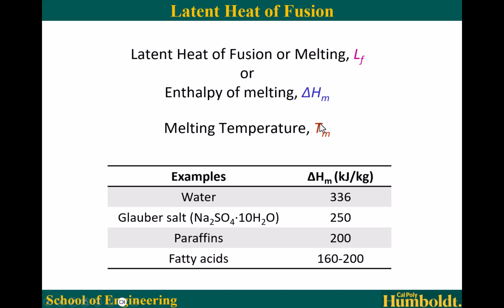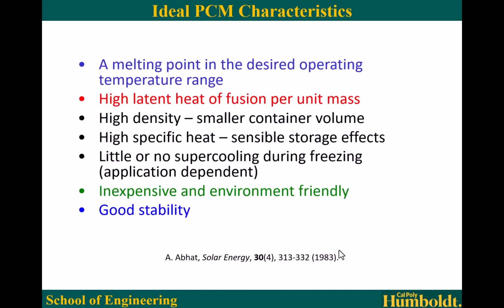So that's kind of the key metric. You can measure the enthalpy of fusion with basically a differential scanning calorimeter. But for this experiment, we already know, and we can look up the enthalpy of fusion for the various concentrations of our materials. But we already know ours is a good PCM material. The one thing we're going to have to look at is our phase diagram to pick our specific composition, and then also to look at some of the thermal stability curves that we can observe here.